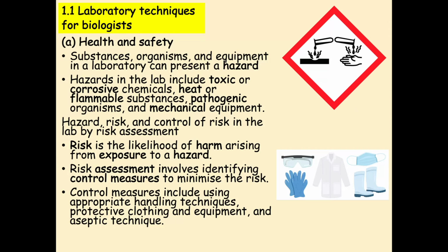And most of them probably make sense, don't they? A lot of them are common sense, but if it's got one of those toxic or corrosive labels on it, you're going to have to be conscious that it could be a hazard. If the substance that you're using can catch fire easily, then again, we have to be conscious of that. If we're working with microbes, for example, that have the potential to escape from the agar plate that you're using, again, that's an issue, and we have to be conscious of how we manage that using things like aseptic technique, and mechanical equipment as well. Something like a centrifuge, for example, is obviously something that could potentially be dangerous if we do not use it appropriately. So all of these things are potential hazards within the lab.